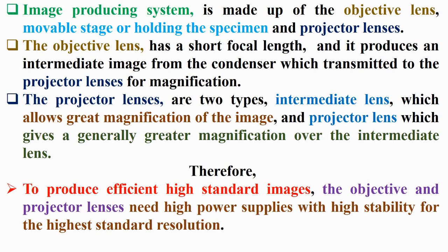Therefore, to produce efficient high-standard images, the objective and projector lenses need high power supplies with high stability for the highest standard resolution, as exhibited in the next slide.